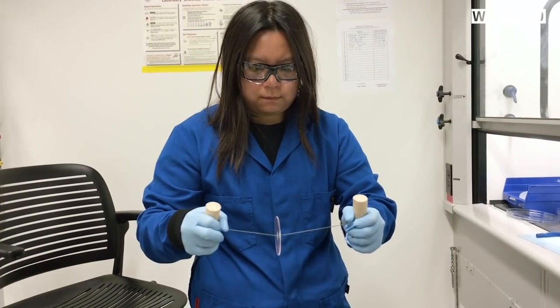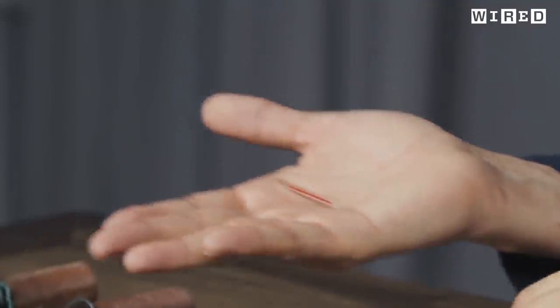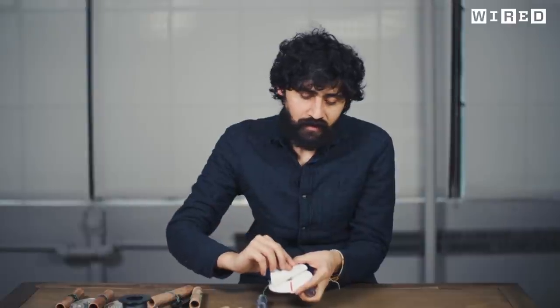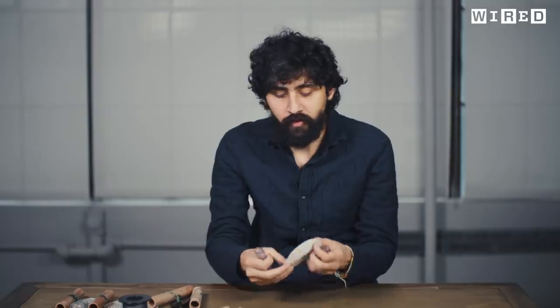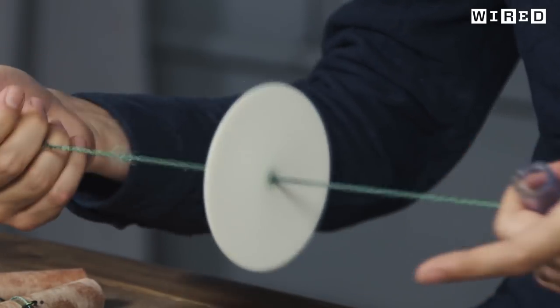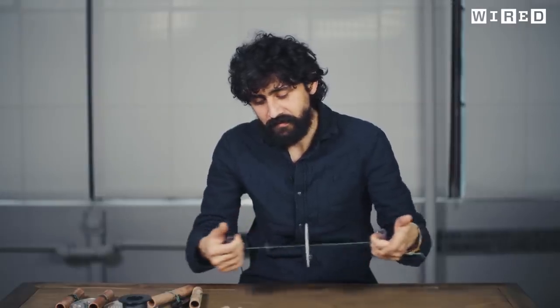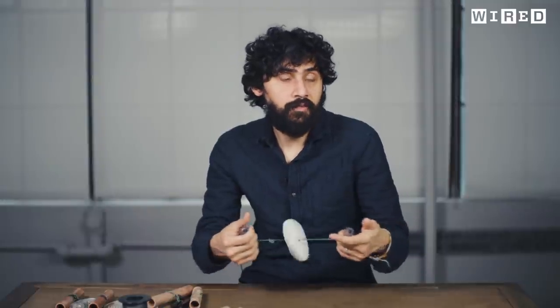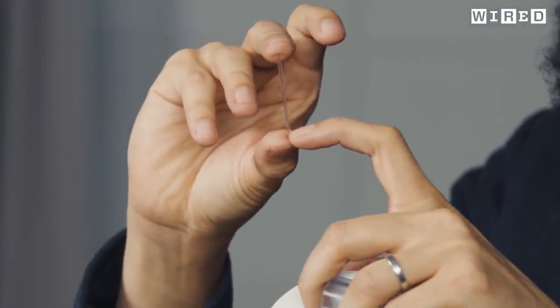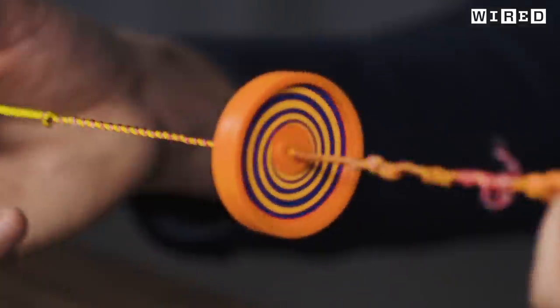Health workers can load a blood sample and power the paperfuge by hand with very little force. In the demo, a glass capillary with beads and glass in water is placed into the device and spun. If this were a blood sample spun for about a minute, the red blood cells separate out from the plasma — and indeed, all the beads end up in a narrow band at one end, with the clear fluid on top.